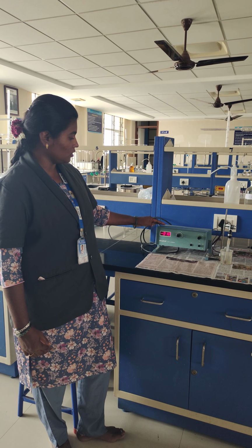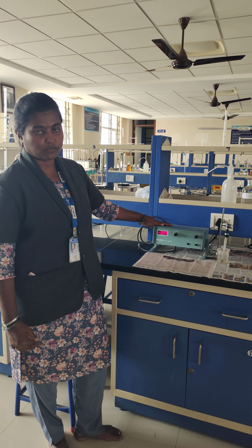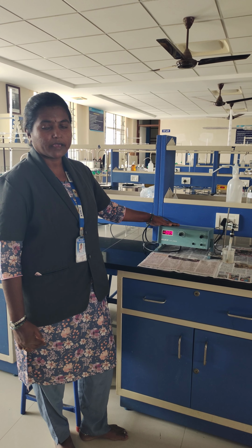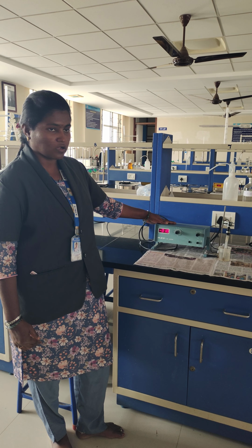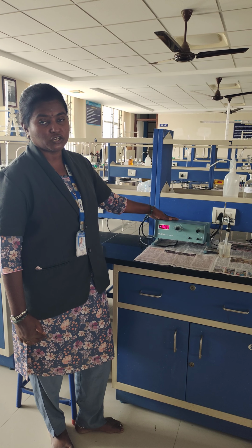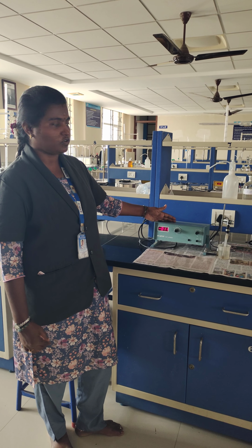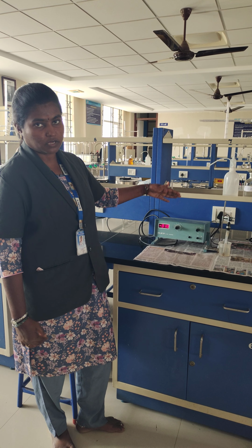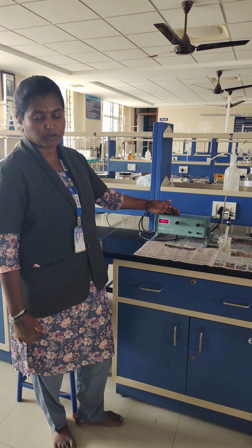In this I am just explaining the titration between a strong acid and a strong base. For that we are taking sodium hydroxide and hydrochloric acid. The hydrochloric acid consists of H plus ions, which are responsible for the acidity of the acid, and sodium hydroxide has OH minus ions, that is hydroxyl ions, which are responsible for the alkalinity of the sodium hydroxide. So we can calculate both the sodium hydroxide normality as well as the hydrochloric acid normality. In this experiment the HCl normality is given. The sodium hydroxide normality has to be estimated, that means calculated.